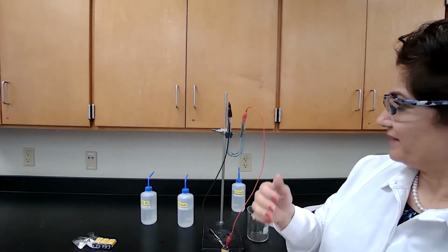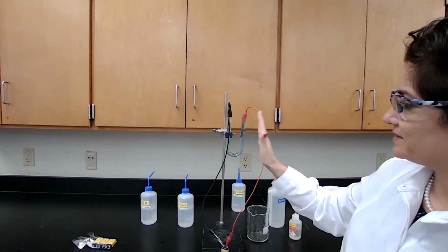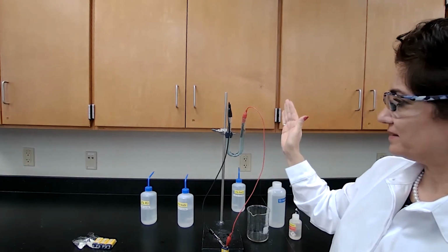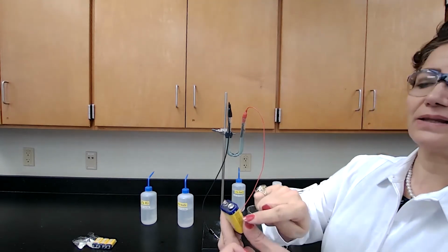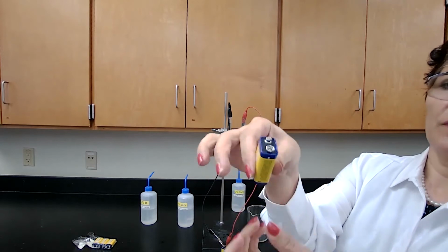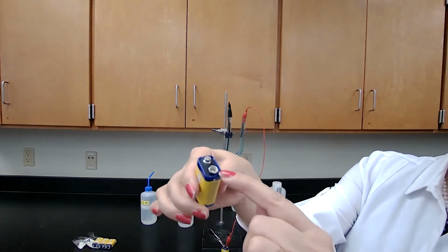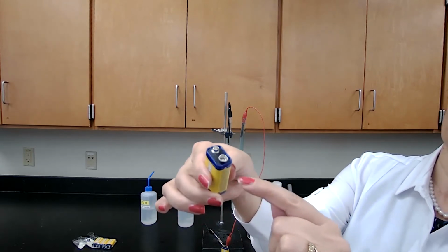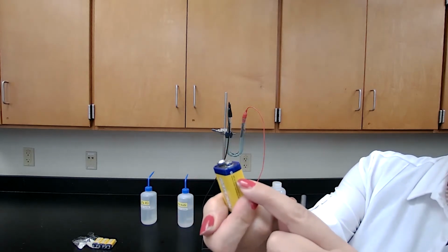Now that we have experienced one of the reactions already, reduction happens on the right side. But why is it happening on this right side? Because the right side is connected to the negative side of the battery. If I show you this battery, I have the negative sign here, there's a different fitting here. So you can see the negative side, and this side is positive.